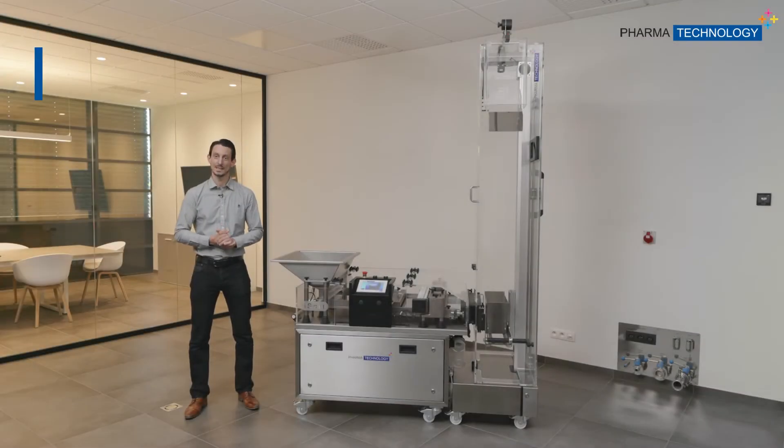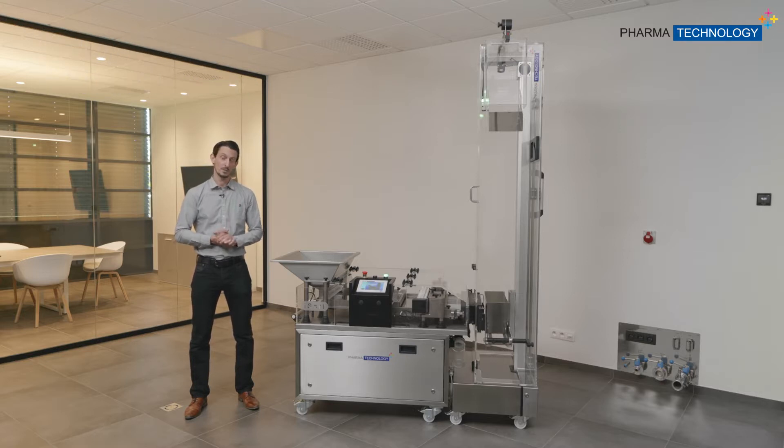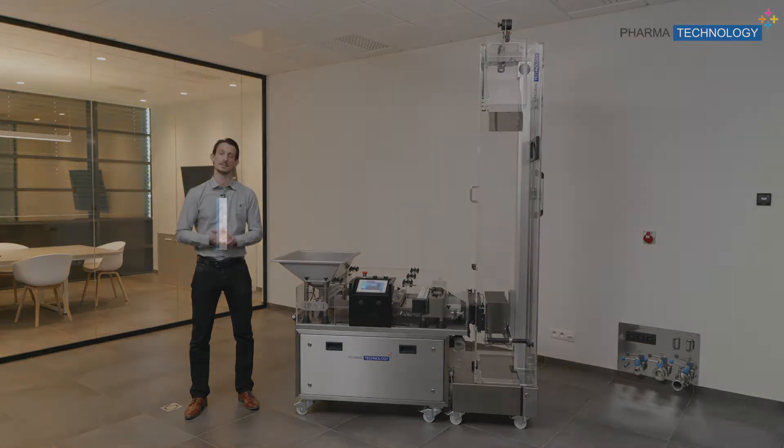Hello everyone and welcome. My name is Ivan Ferro and I'm Technical Director here at PharmaTechnology. Today we will talk about one of our latest developments, the iSort combined with the iLift. This is a machine for sorting and lifting tablets for packaging lines.